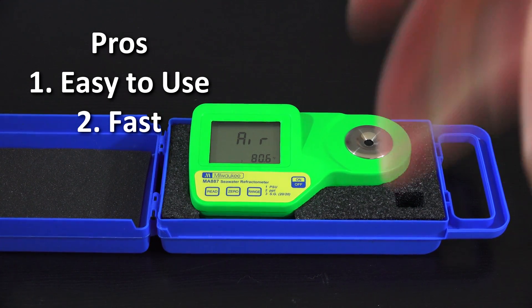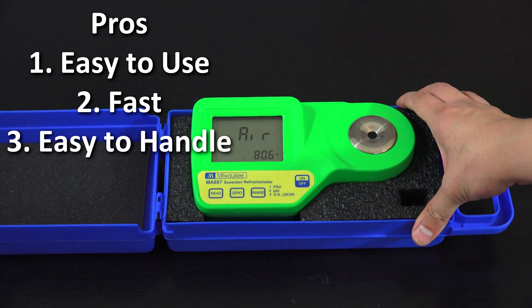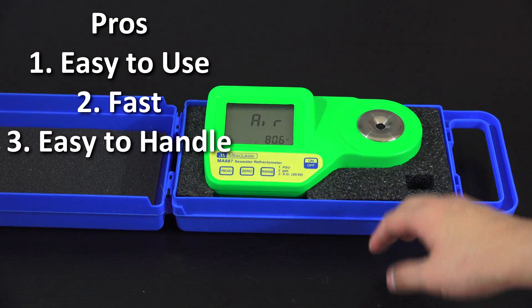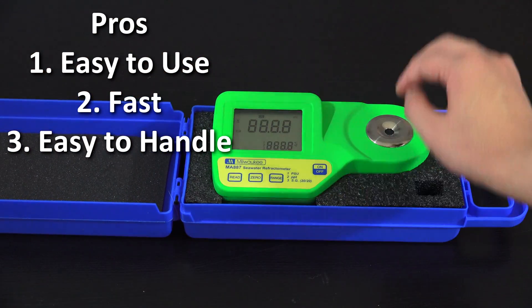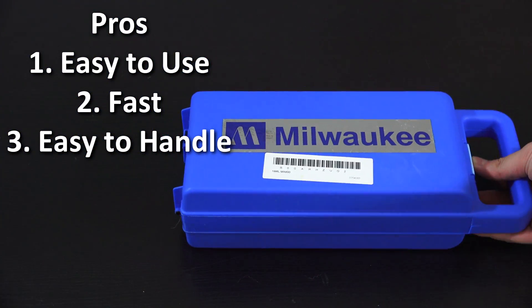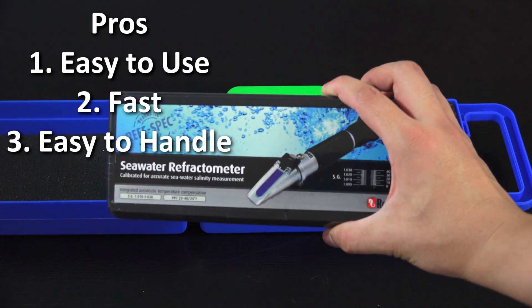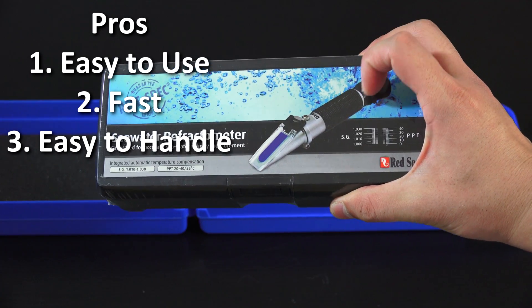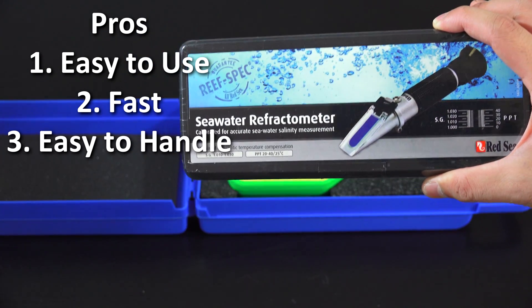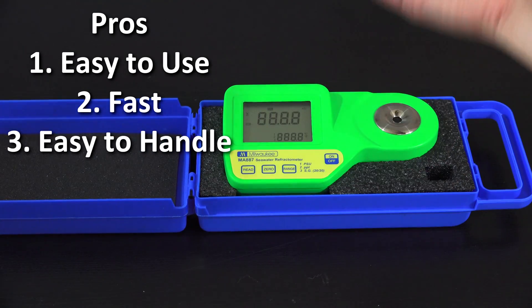The third pro is it's easy to handle, especially if you buy this case — it doesn't come with the case, but you can put the unit in, it just opens like this, you hit on/off, place your sample, and you're good to go. Once you're done you close it and grab it and go. With the analog devices you'd have to play with knobs to fine-tune it, make sure you don't drop it, and look through a light source — much more of a hassle. With this I can just throw it anywhere.